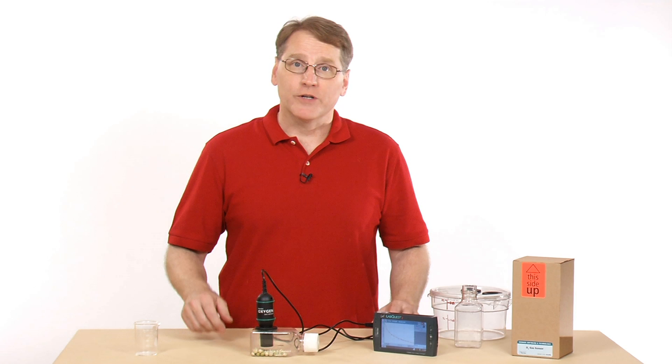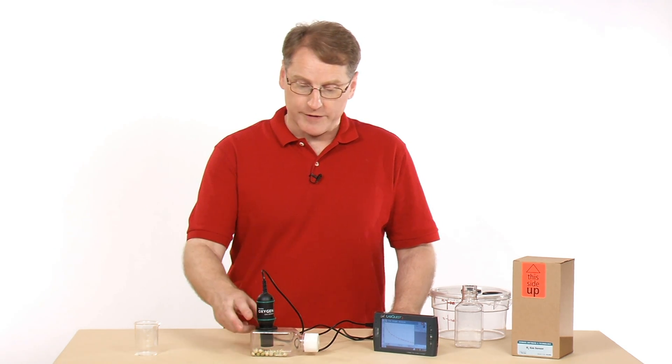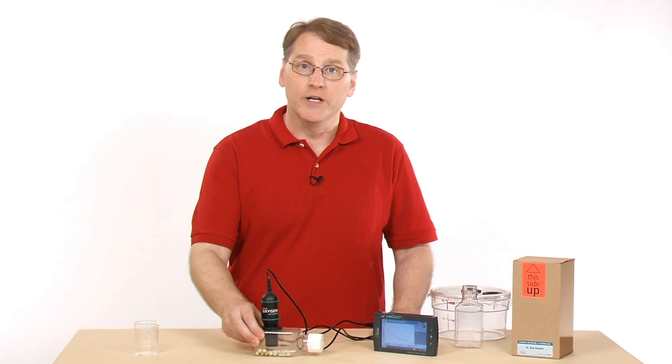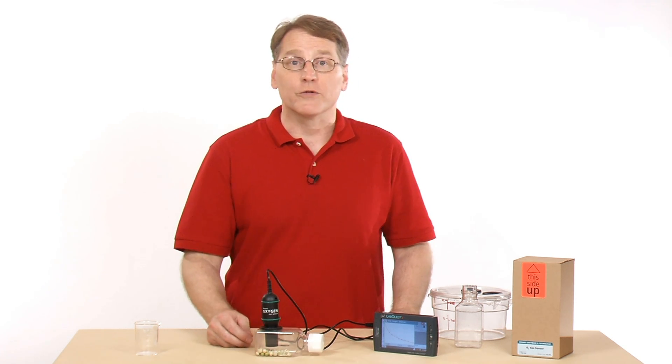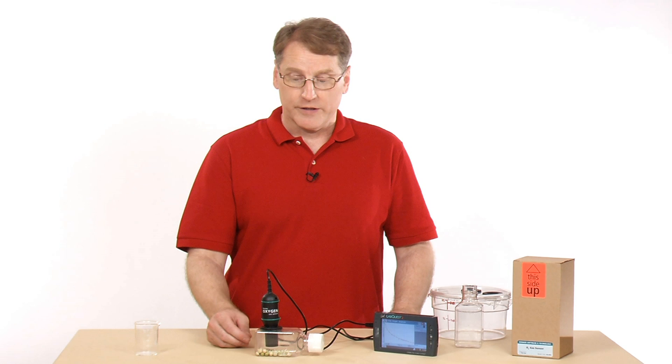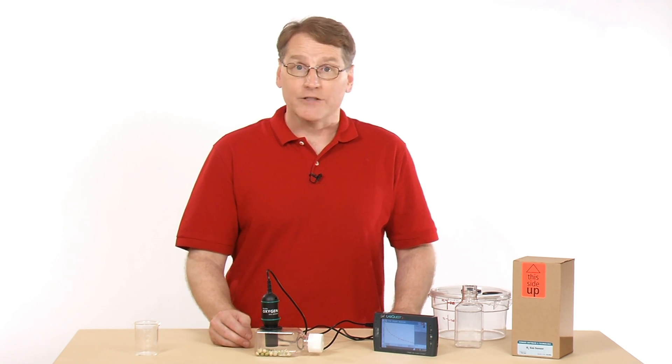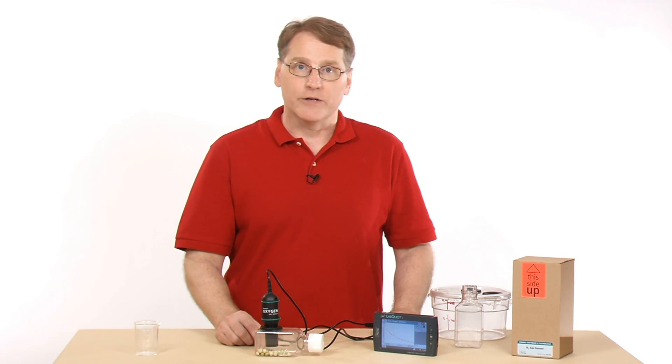The oxygen sensor we've seen is quite useful. We used it for the respiration here, for the cellular respiration. We could have used it for photosynthesis. We could have looked at the oxygen consumption by various animals. So anything that involves gaseous oxygen, it's definitely good for that. So it's used across the board, and it's definitely a great sensor to have.